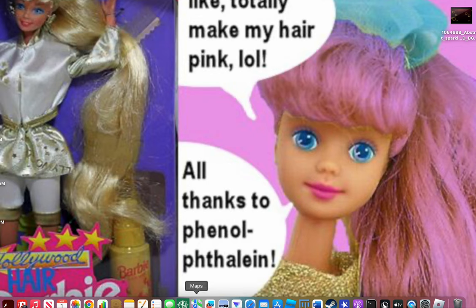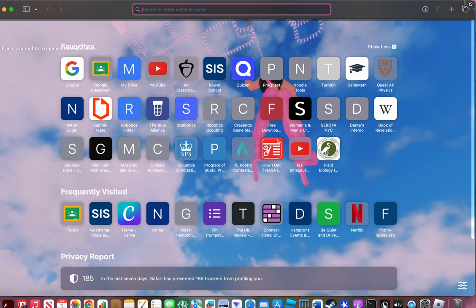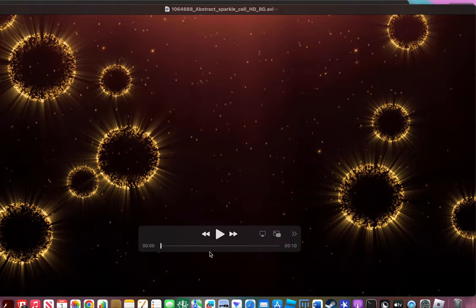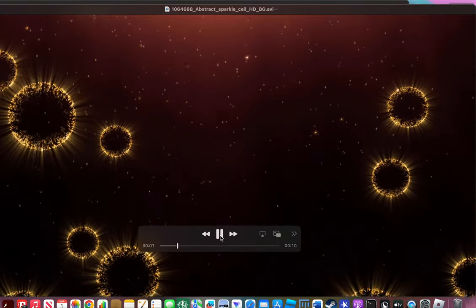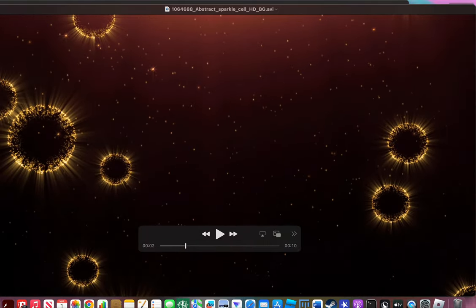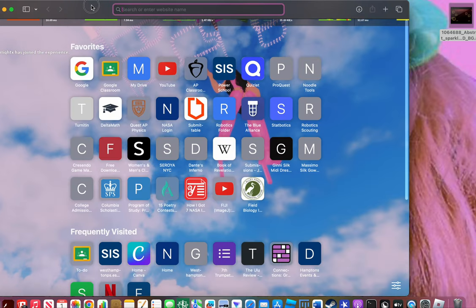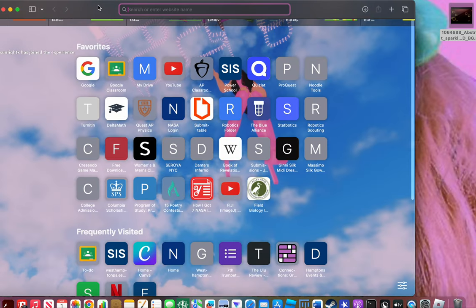Hello, my name is Willa de Rovin and I'm going to show you how to use Fiji ImageJ tracking software. The first thing you're going to do is get a video. I'm going to use this stock image of cells moving. You're most likely using this for a project, so whatever project video you have, this is going to be for tracking non-circular objects such as cells moving or fish swimming.